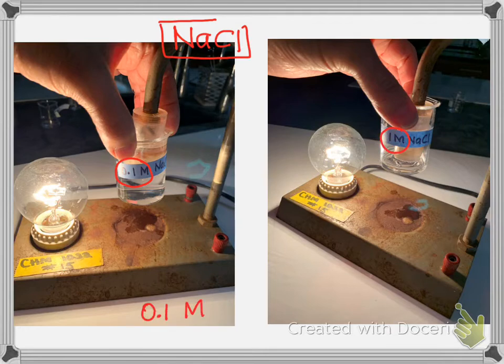The capital M is a concentration called molarity. You'll do more with that in chapter 8. And this is 1 molar. The one on the right has more concentration.